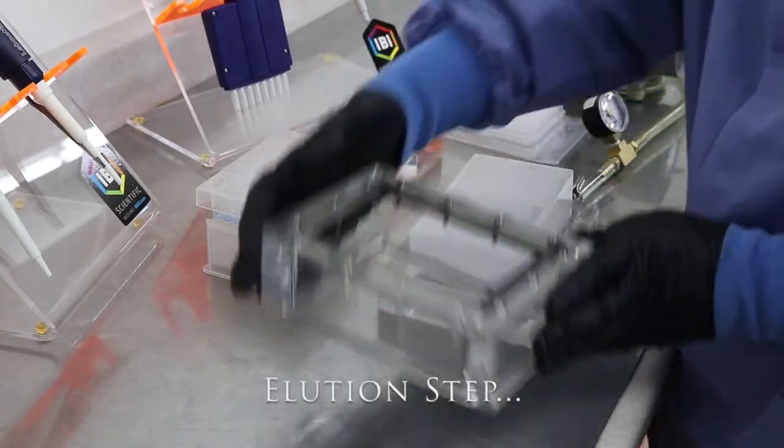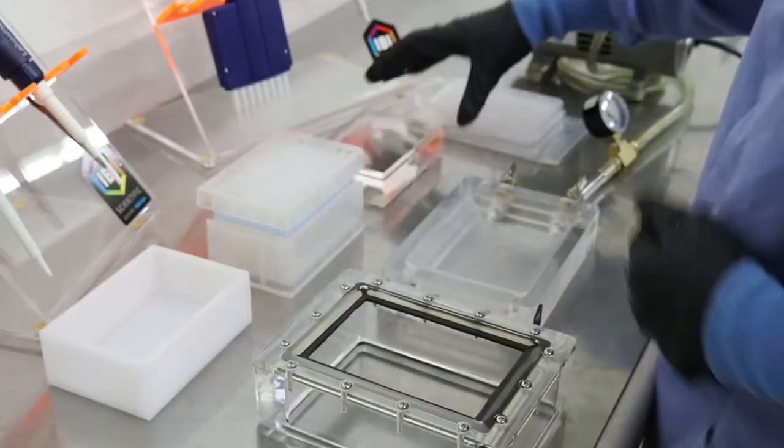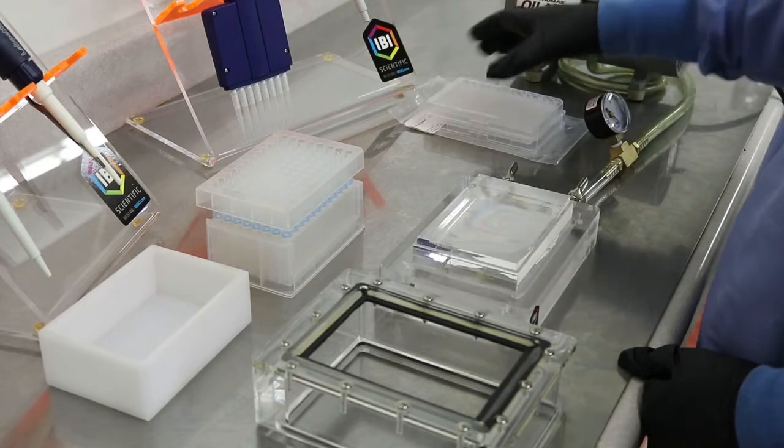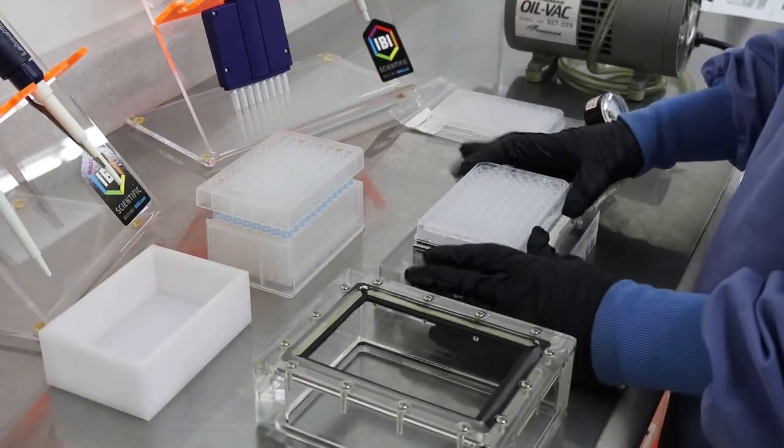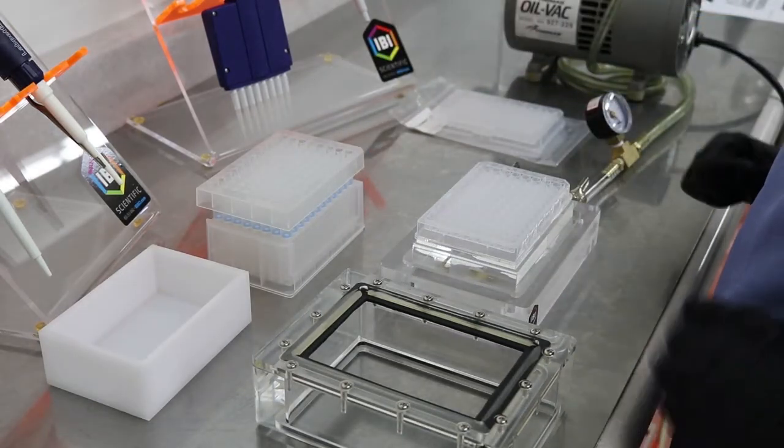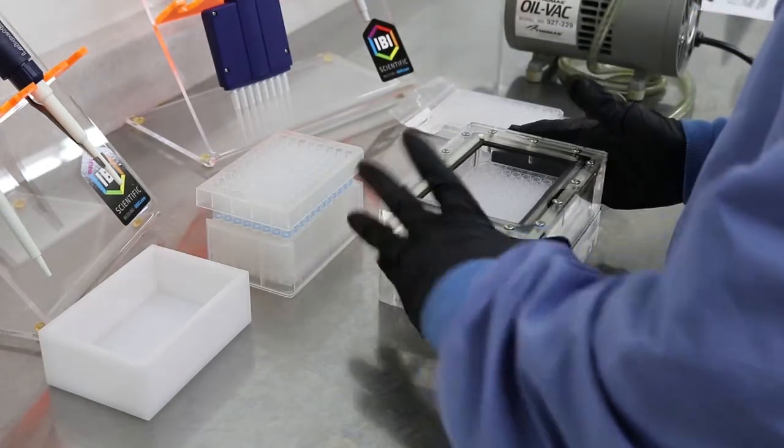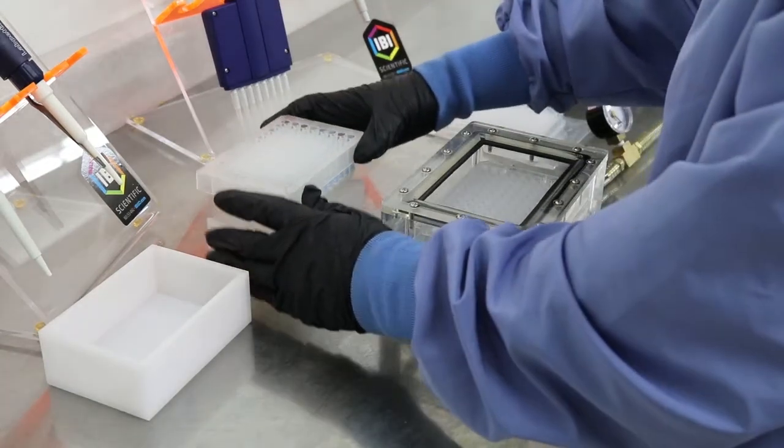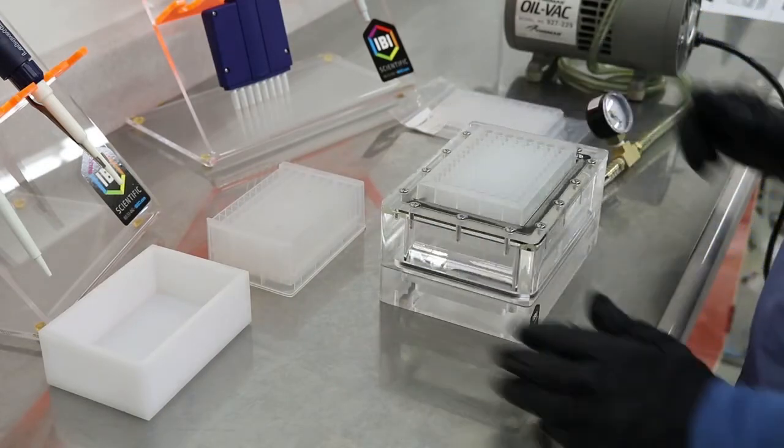The elution step has a very similar setup, but to elute, remove the top piece and waste tray and place the collection plate spacer into the base of the vacuum manifold. Place the collection plate on top of the collection plate spacer. Place the top piece on the base. Place the binding plate back on the top piece and open the vacuum to elute.